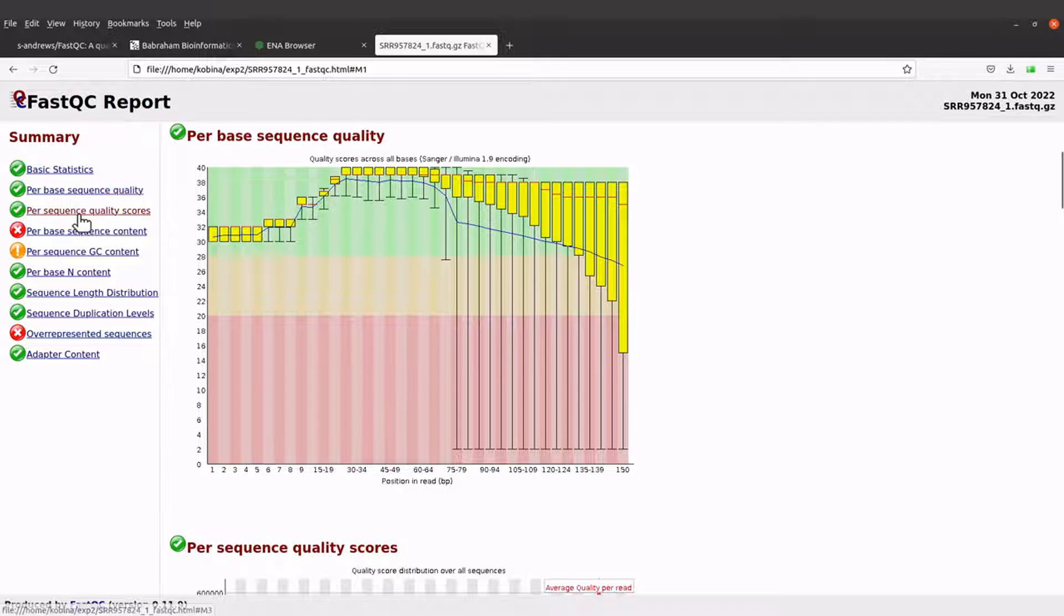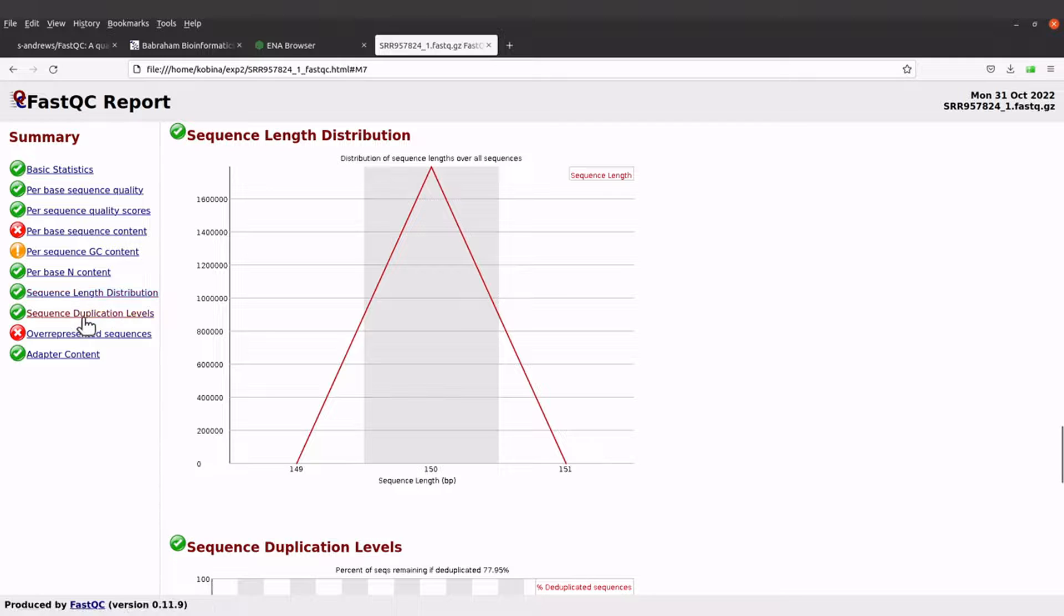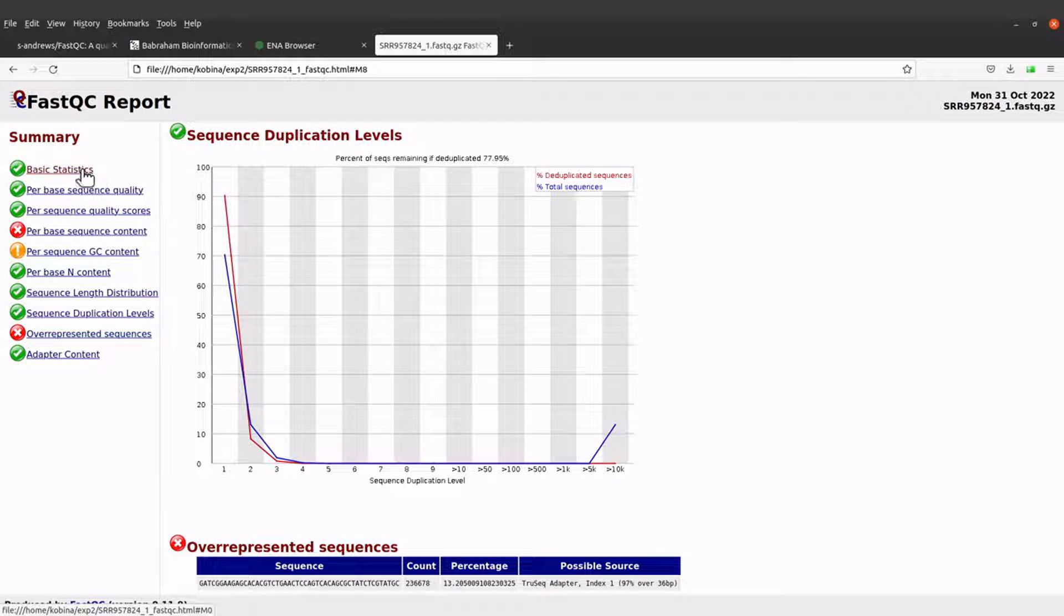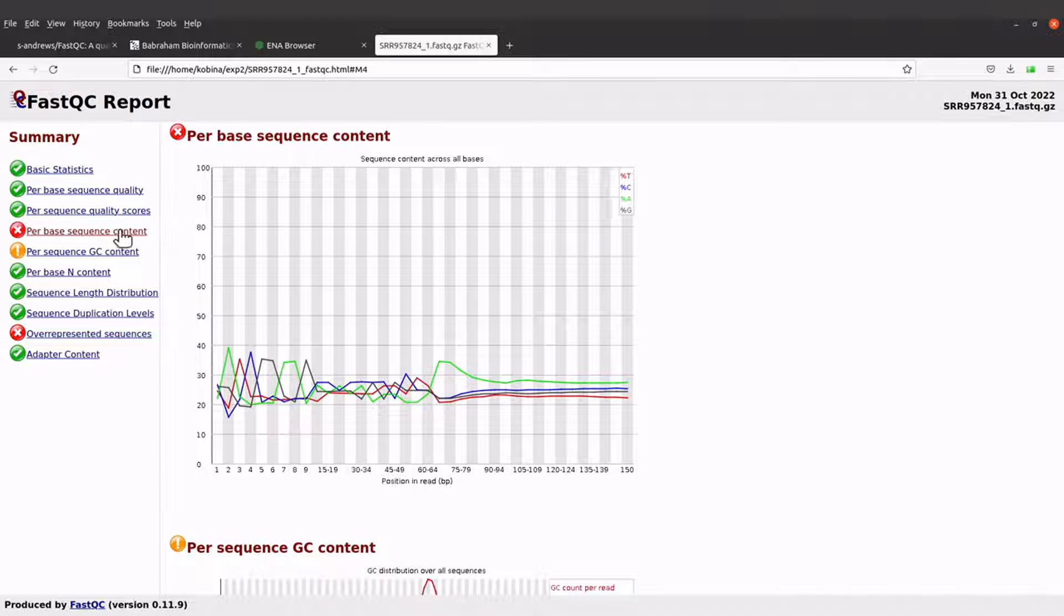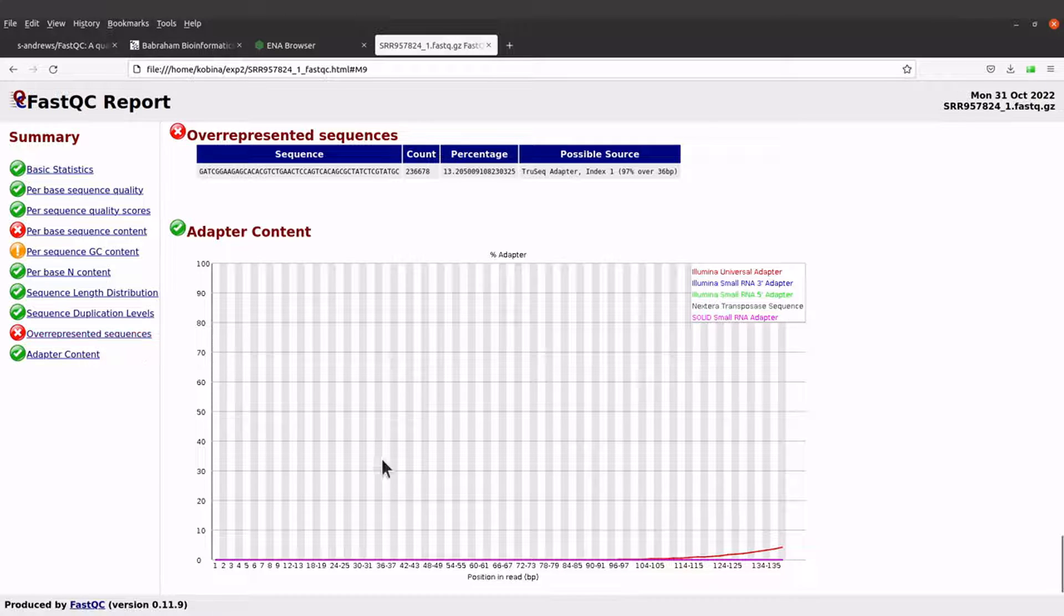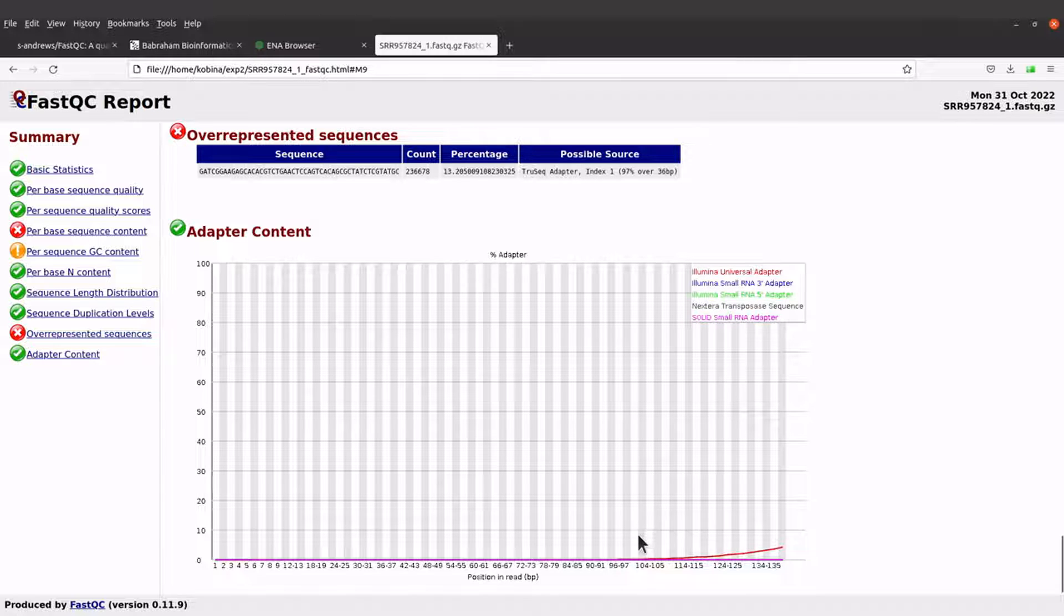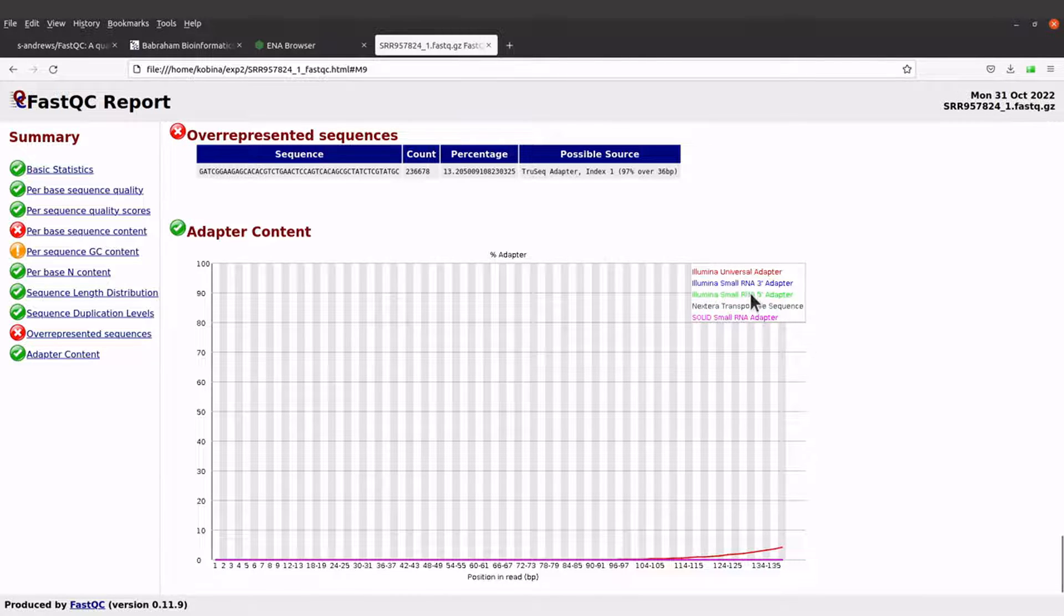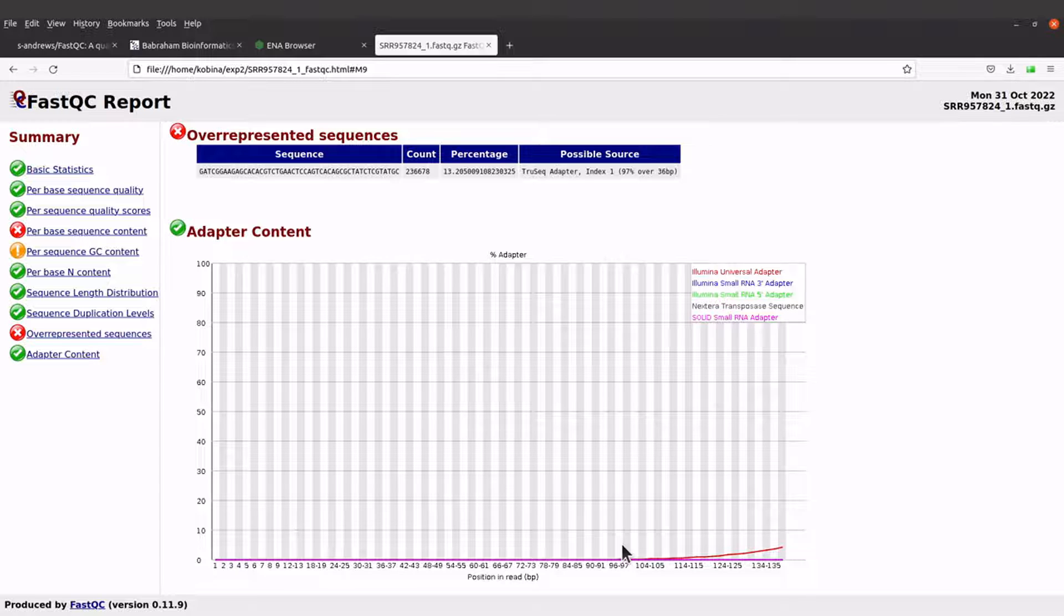Now let's look at something here. I mentioned the per base sequence quality, and this one here is showing some flags, red flags, so that means something is probably wrong. This one too, overrepresented sequences. Here we can see that there are some Illumina adapters here. That is why you can see this line also coming here. The color here has also been an indicator, and these are Illumina universal adapters.